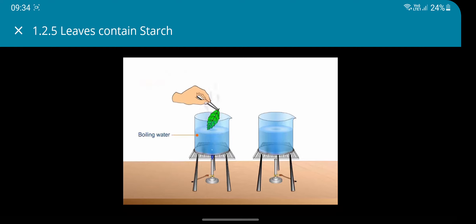Bleach the leaf by boiling it in water and then in alcohol.